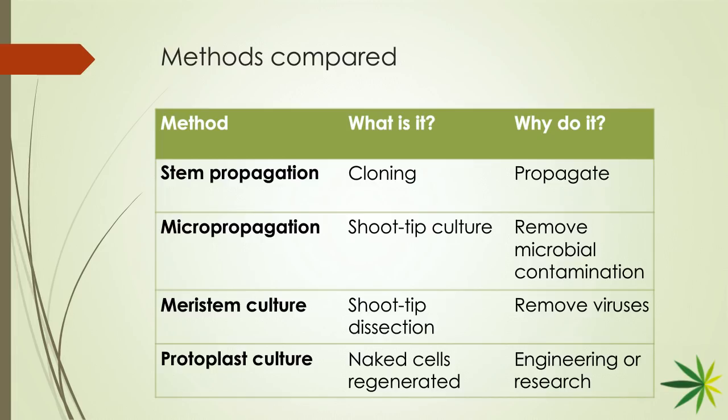Micropropagation, you're just taking it a little bit further. You get a better pair of scissors. You might use a razor blade, but you're getting down to the tip. And it's a small bit of tissue, but it's still quite visible and something you can handle without using magnification, but you would need tweezers. And it requires a little bit more care at this point, correct? And food source and lighting. And at this point, the plant is so damaged and cut down that the stem can't survive on its own.